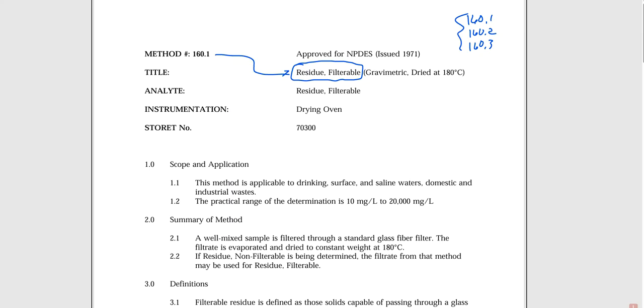All right, so I'm going to give you a little bit of a rundown of what this method is all about. Let's say that you go into your kitchen, and here I've got a big old pot of water on the stove top, and I'm getting ready to boil spaghetti noodles. I'll look at all the cooking shows, and they're going to say, oh, well, Tracy, if you want a really good noodle, then you're going to put sodium chloride into that water, and that way it will flavor your noodle, and it's all about building flavors, one ingredient at a time. So I'm going to add sodium chloride into that water and stir it up, and what's going to happen, folks? Of course, it's going to dissolve. All right, so that's good.